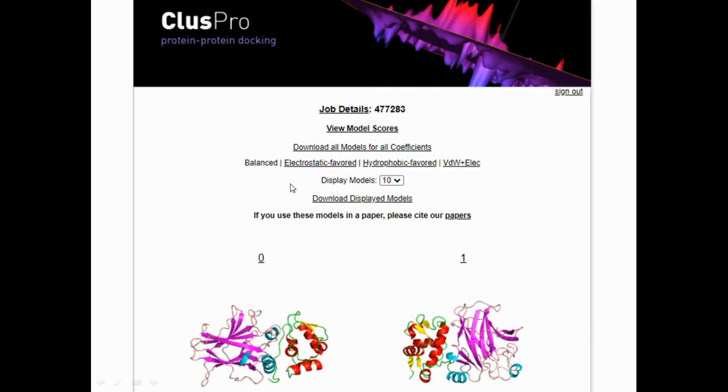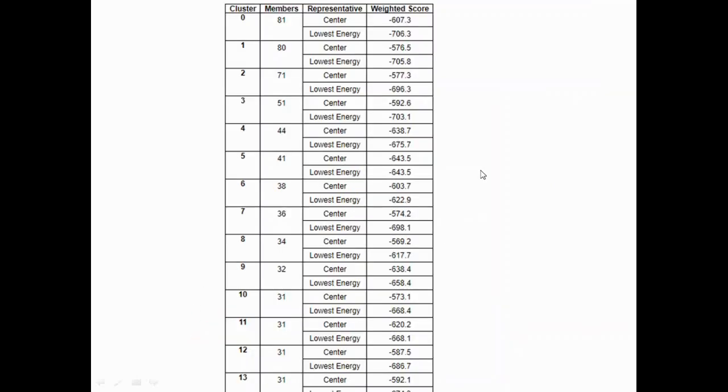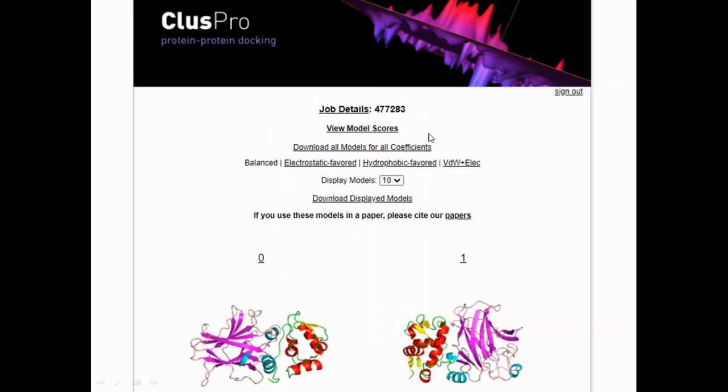Like this, you can select electrostatic, hydrophobic, van der Waals based on whatever you want, whatever you're comfortable with. But in all the four cases—balanced is your potential energy which is your overall energy it's considering—even if you select electrostatic, hydrophobic, or van der Waals, it's still going to give you your first cluster as the best docking score. This is how you perform protein-protein docking using ClusPro.